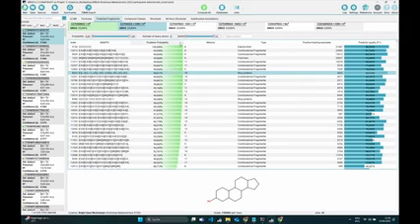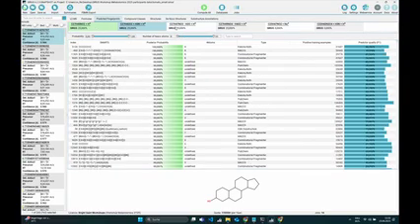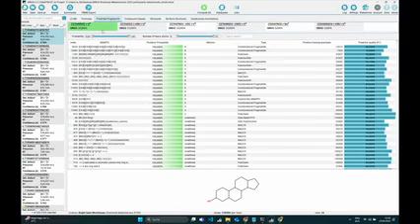The one thing that I forgot to mention is that the formulas that you had in the list before are now in this horizontal list, and you can also scroll through them.